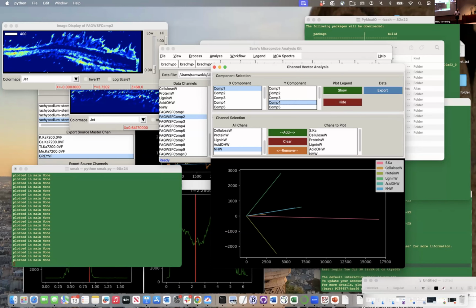And so you really want that good bright field to make those matches, because trying to do a fiducial marker on all these cool organics versus metal content is not an easy thing to make. And again, that's the power of merging those tools together, but you're not seeing the same thing. So you really need a good fiducial or a good co-registration.